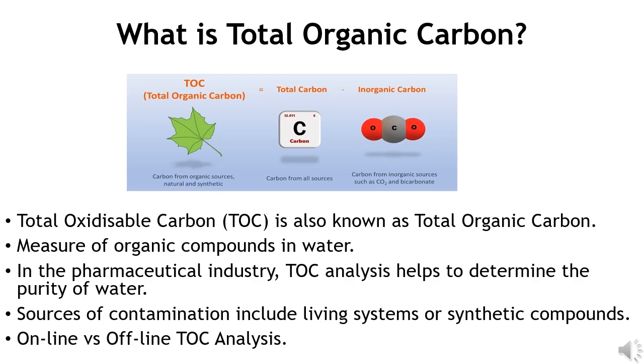In the pharmaceutical industry, TOC is an analytical technique that helps determine whether the water used in their processes is pure. However, all water contains carbon to a certain degree, and sources of water contamination may include natural or altered products of living systems or man-made and synthetic compounds.